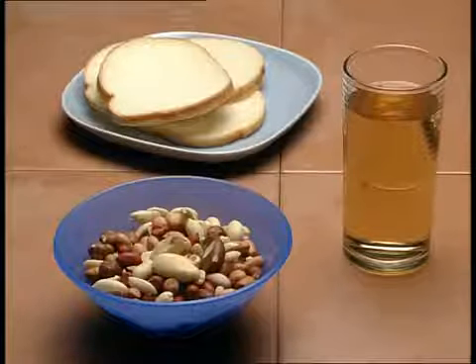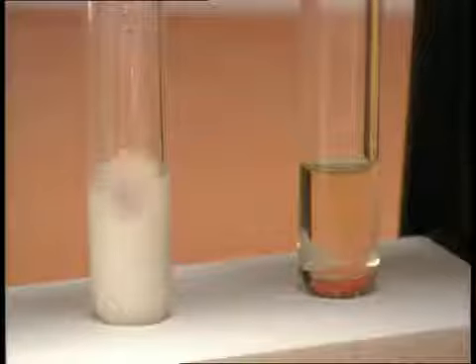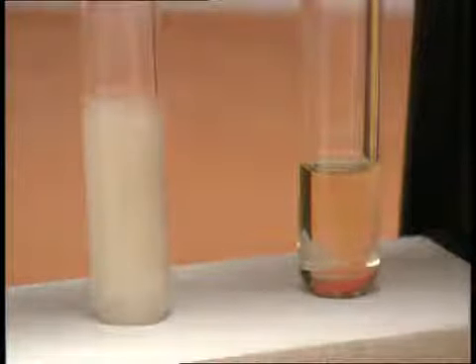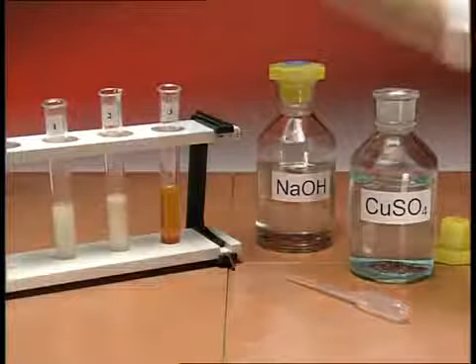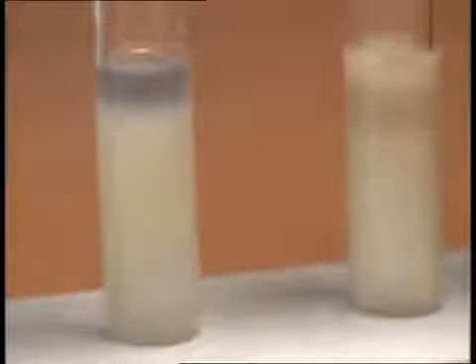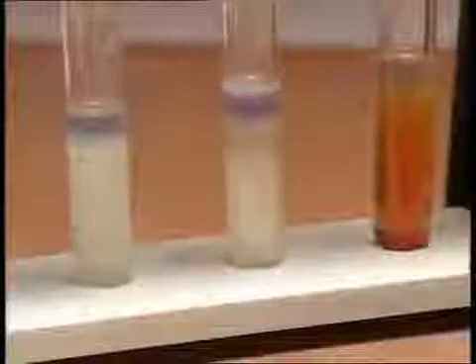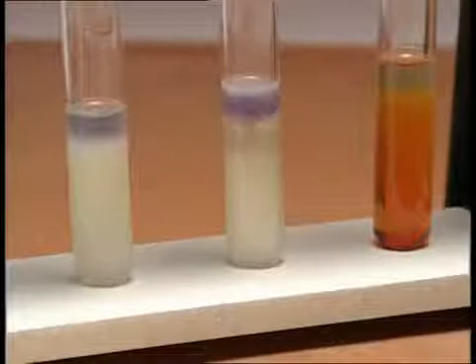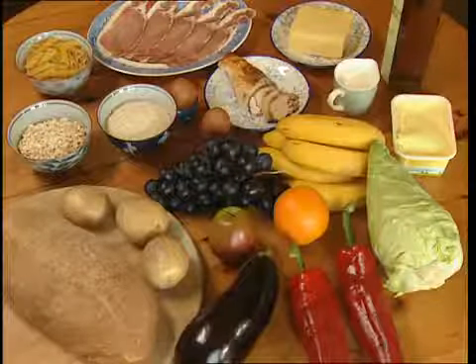So which of these will test positive for protein? Bread in tube 1, nuts in 2 and grape juice in 3. Both the bread and nuts contain protein. Which contains more? Food tests revealed the nutrients in our diet.